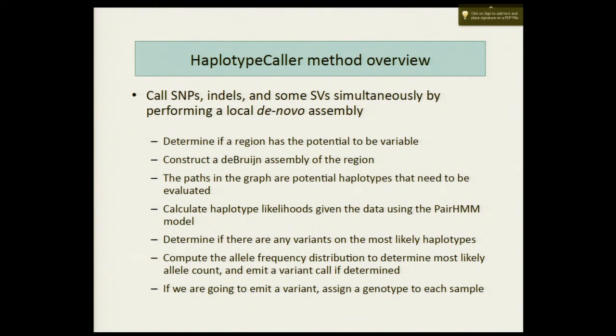Sort of. The difference though is that the Indel realignment, it's using like the known indels, right? And that's its possible indels. Whereas this is building any number of possible indels based on the reads itself, right? So it's not trapped by using prior databases or the read data itself. It's using a bunch of reads in a region and building alignments out of that. That's the real difference, is that it's using a large region instead of a smallish region.